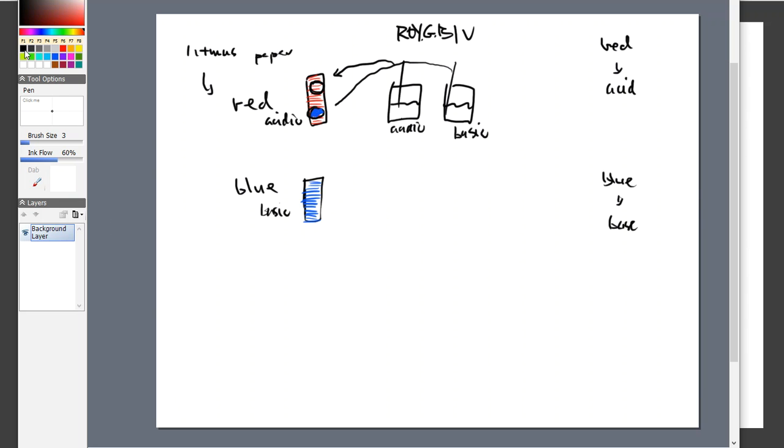So if I take my acidic solution and I put it on blue paper, my acid is red. It should go red. So that drop of solution will make that blue paper turn red. There's the confirmation that I have an acidic solution in my beaker.